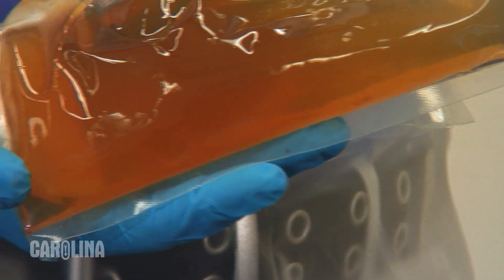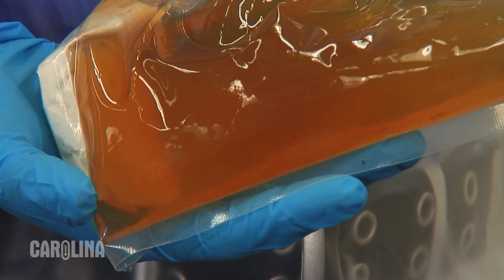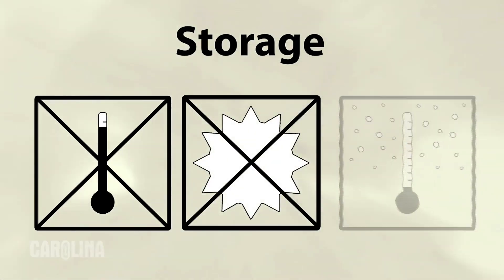Oftentimes, larger specimens packed in single bags or bulk bags will have fluid that will start to drain from the specimen and pool in the corner of the bag over time. This is normal and will not hurt the specimen. In fact, this fluid helps keep the specimen fresh during storage. It's important to keep your specimens no higher than room temperature and out of direct sunlight. Refrigeration is not necessary.